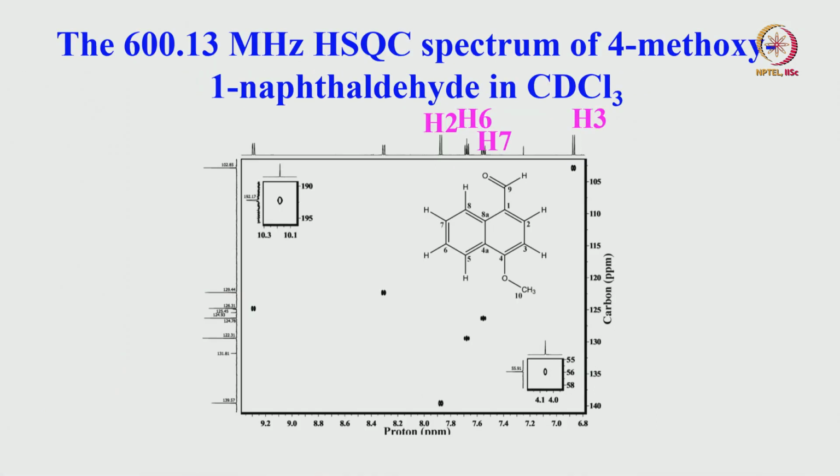So, we will continue from that now with 1 or 2 more examples, and then we will see what other things we can do and try to understand a few more details about HSQC.